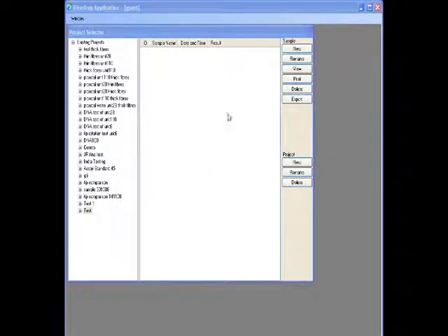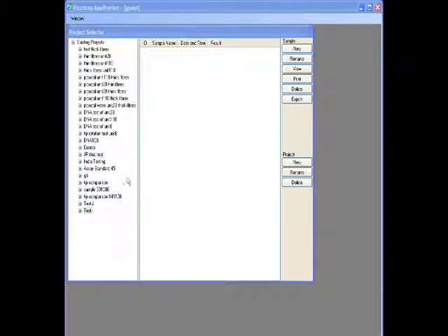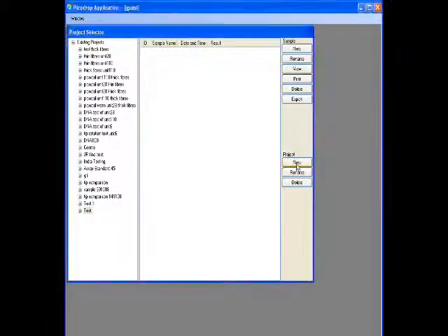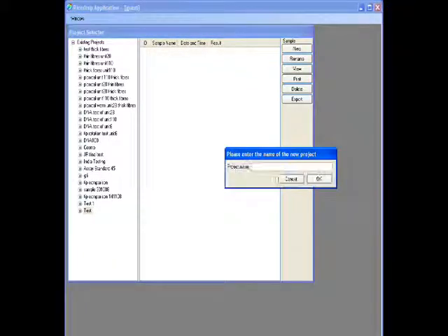On logging into the software, the user is presented with a tree of projects. To create a new project, click New.